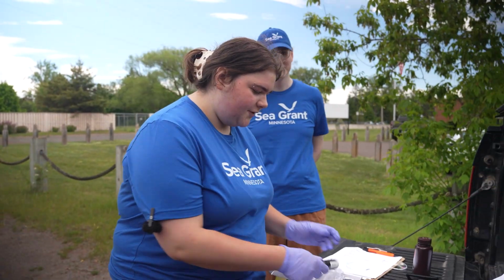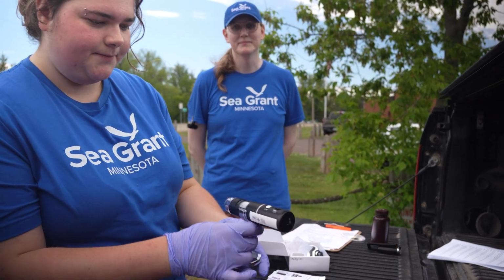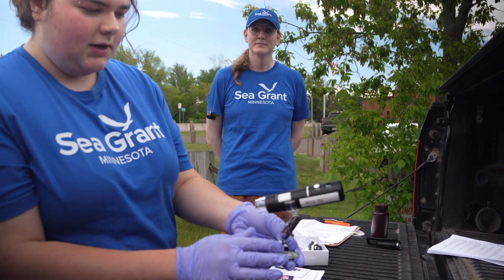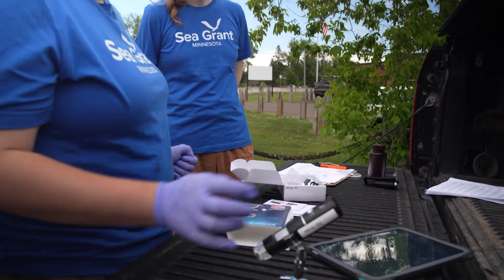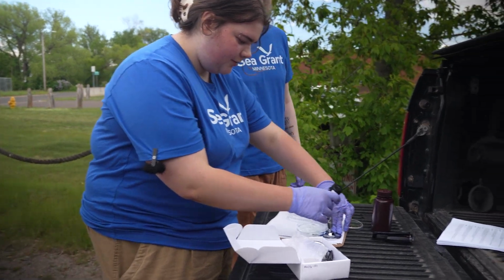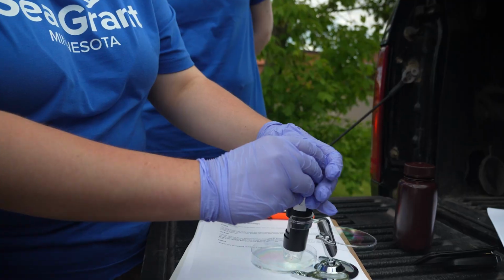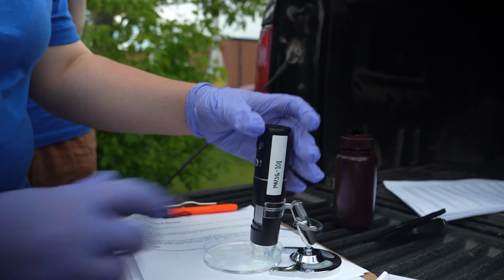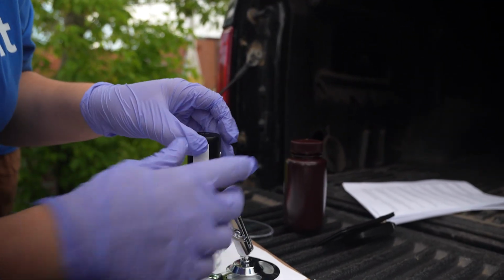Once you're in the field and you're ready to use your microscope, you can connect the microscope to the base using this groove here. And then you just hold the on button to turn on the microscope. There'll be a little plastic cover on the top that you can remove. So then you can put your microscope right above your sample, and you can use this slider on the side to adjust the intensity of the LED, and you can use this slider on the side to focus the microscope. And there are also buttons on the back to zoom in and out.